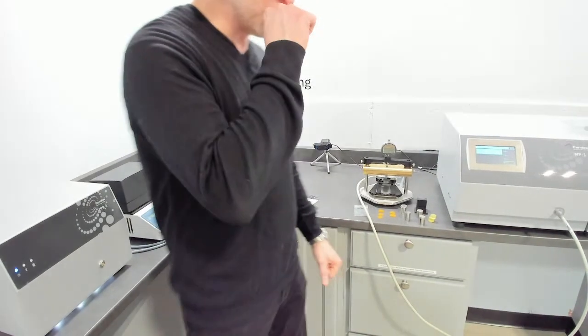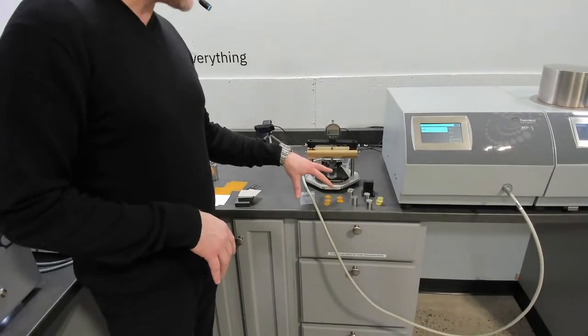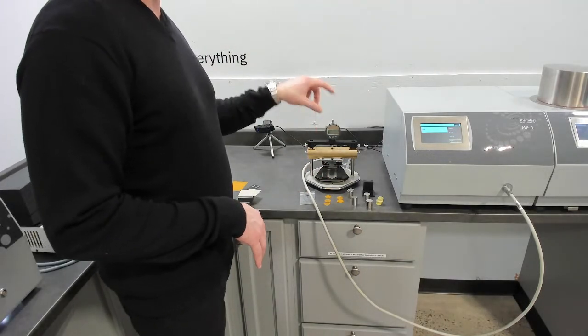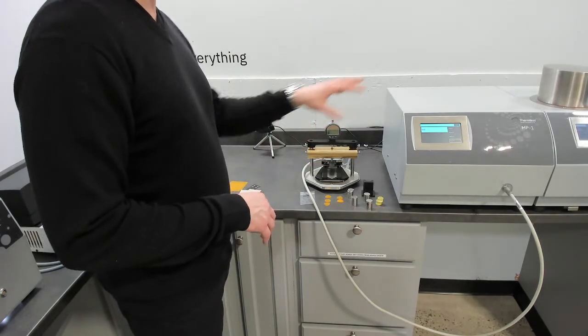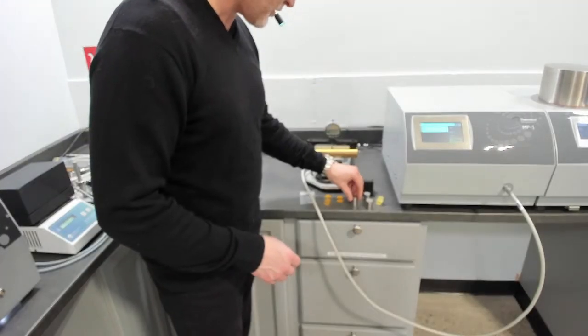So coming back to the MP1 specifically. This is only available on the MP1. This is our transient resistance thin film package. This uses the technology we developed for the MP1, which is for measuring the resistance across two objects. So it works off the principle.